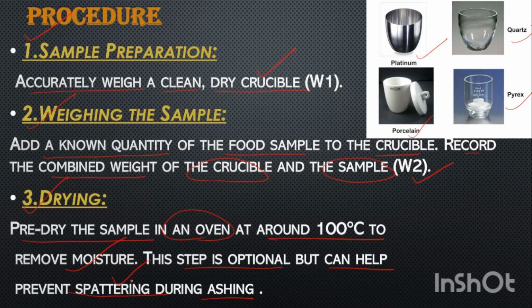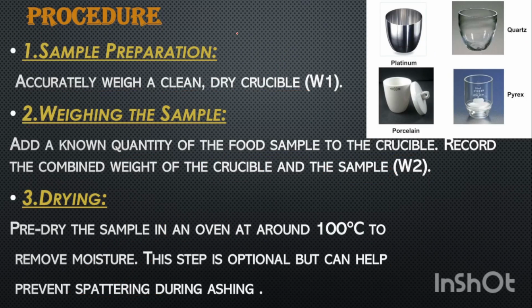Spattering means small drops of liquid, especially noisy when they spatter. Samples are usually 1 to 10 grams, and solid foods are finely ground and carefully mixed. Before ash analysis, samples high in moisture are dried to prevent spattering. Samples high in fat content are defatted by solvent extraction, which facilitates the release of moisture and prevents spattering. Avoid contamination of samples by minerals in grinders, glassware or crucibles.